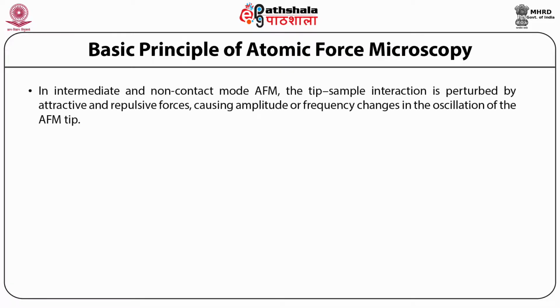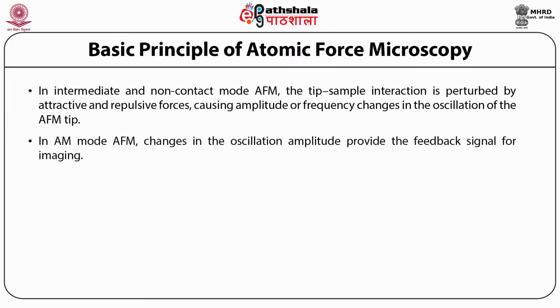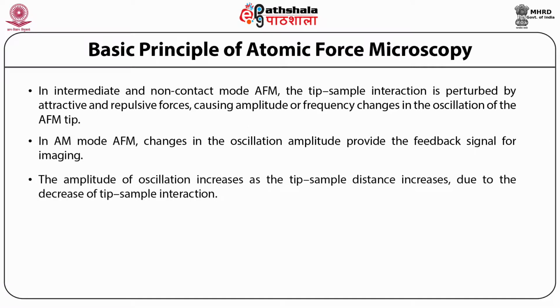In intermediate and non-contact mode AFM, the tip sample interaction is perturbed by attractive and repulsive forces causing amplitude or frequency changes in the oscillation of the AFM tip. In AM mode, changes in the oscillation amplitude provide the feedback signal for imaging. The amplitude of oscillation increases as the tip sample distance increases due to the decrease of tip sample interaction.